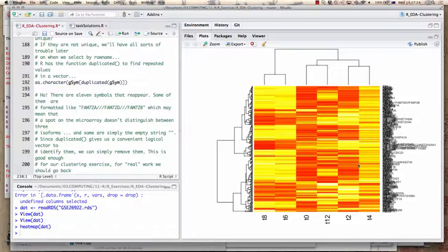We see red, yellow, and white colors — these are expression levels, because that's what we put in. The expression levels are coded into a spectrum of colors corresponding to cooler and warmer colors. Red values would be low expression levels, and yellow or white values correspond to higher expression levels. This is an encoding of values into color.